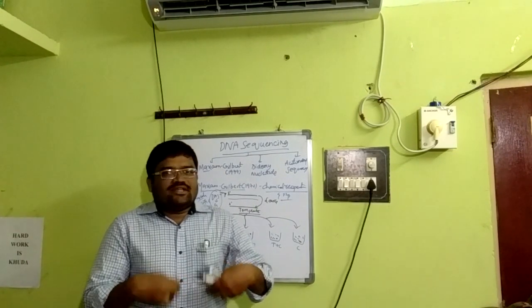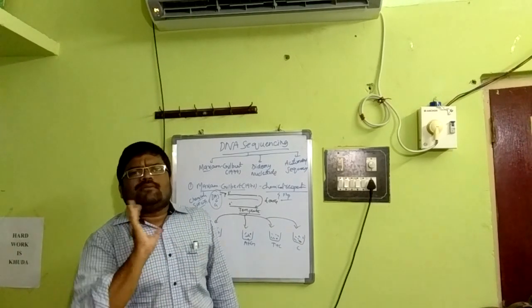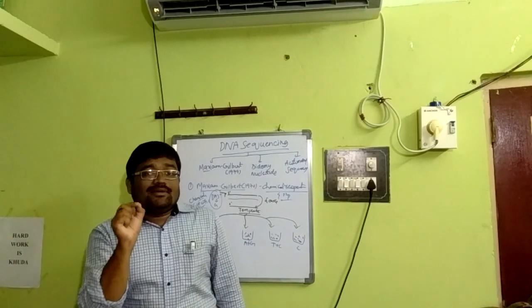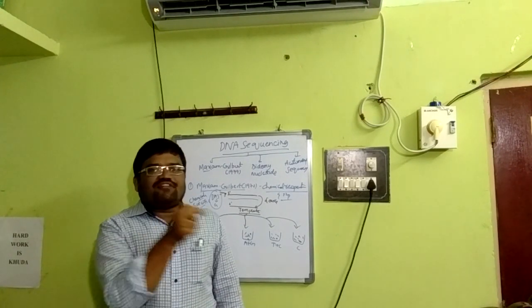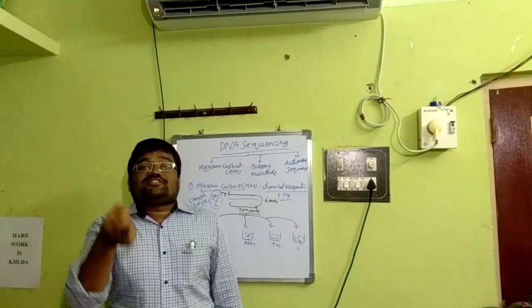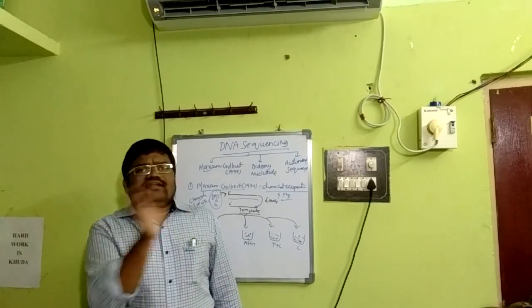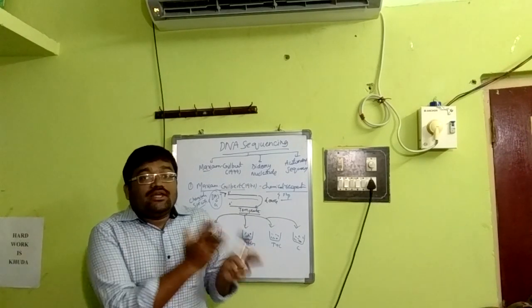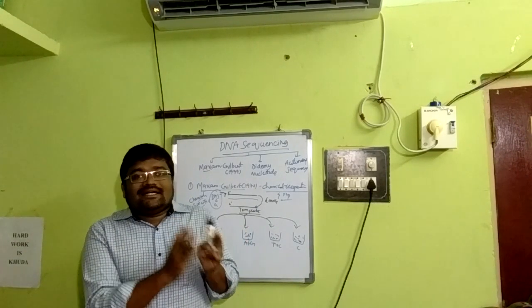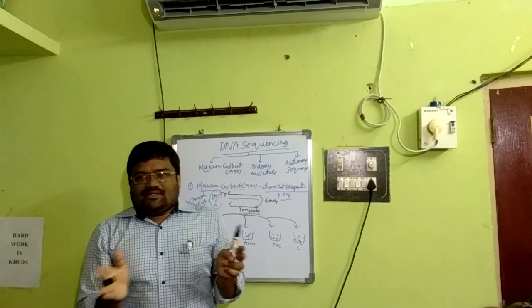We are not going to discuss the chemical mechanism, but just understand that certain chemicals can break down the DNA fragments at particular locations based on their specificity. DMS targets G and other chemicals target other residues as well. That leads to breakdown of the targeted, radio labeled DNA fragment into small fragments.